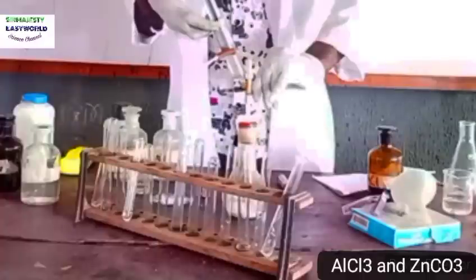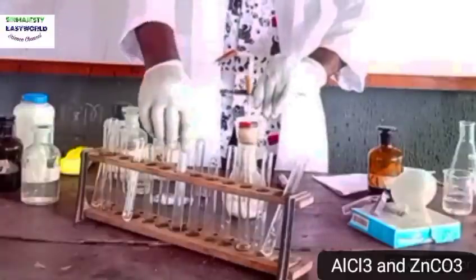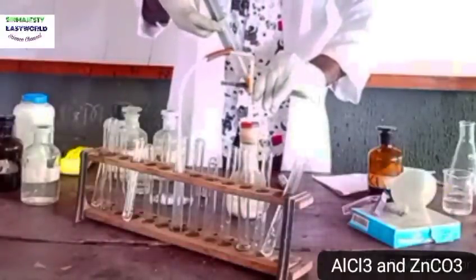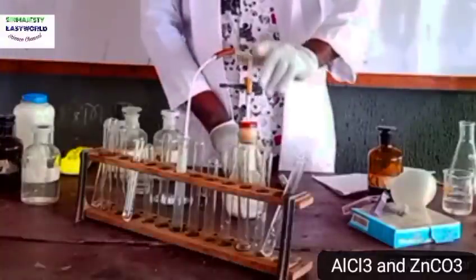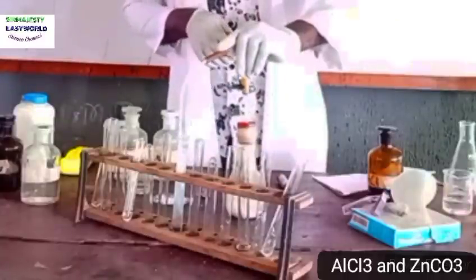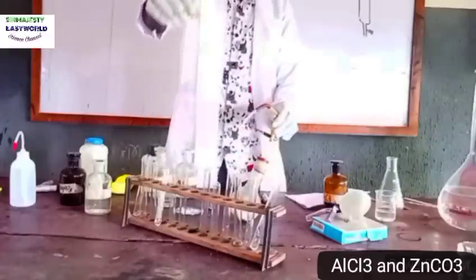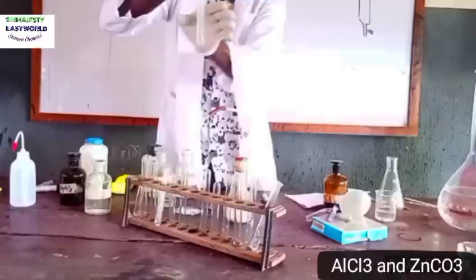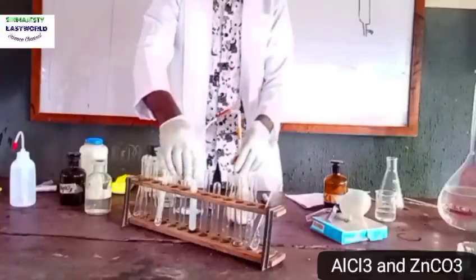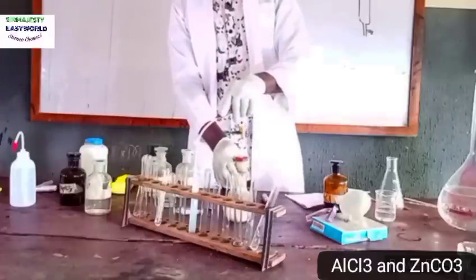If I introduce more, it has already turned milky. See, let me introduce more of the HCl. So that's very much obvious. So it has turned the lime water milky, showing that the gas is CO2. So the gas being bubbled in is CO2, so the gas is still being produced. So as you bubble more, if I shake this, see more bubbles come.